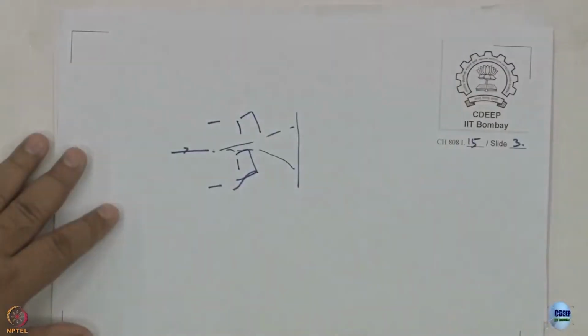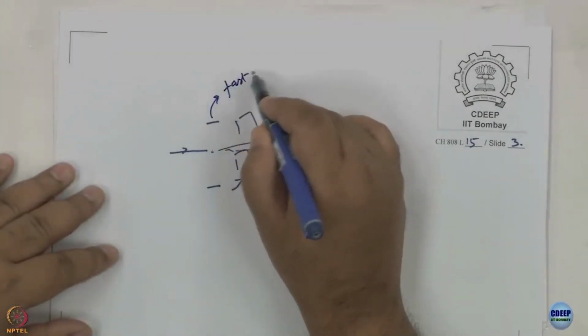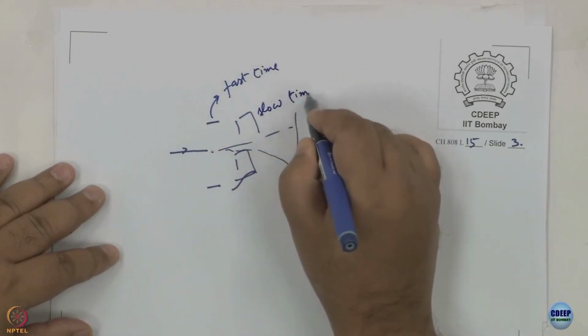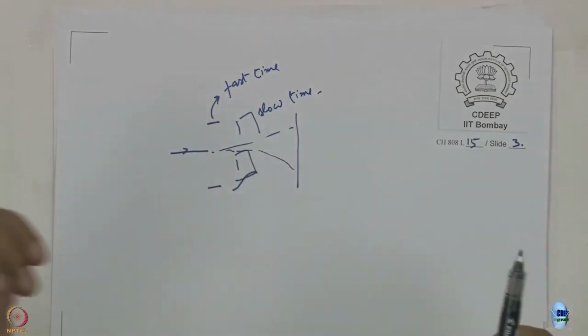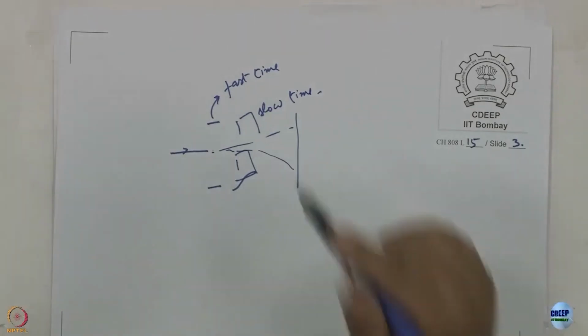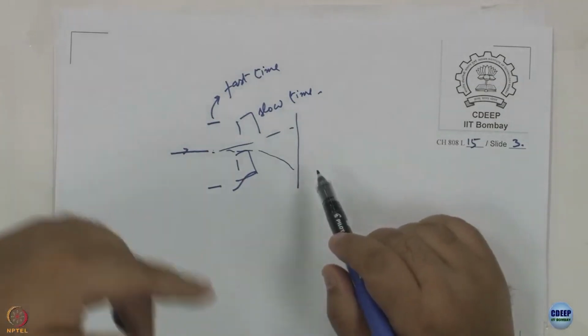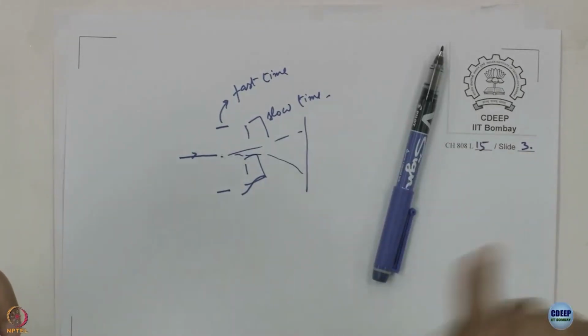The other thing you could do is that suppose you want to look at some kind of a reaction, then you can again, like in an oscilloscope, have two plates, one horizontal, one vertical, and this can be the fast time axis, this can be the slow time axis, meaning you apply a voltage here that gives you the dispersion in say picosecond or nanosecond or whatever it is. In the slow time axis, let us say you apply a similar voltage, but in microsecond or millisecond. Then what will happen? You see decays at different times.